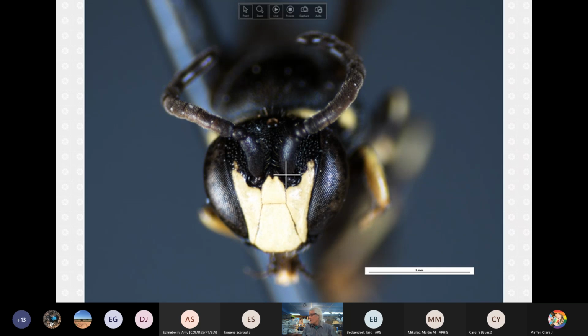I only have one specimen in my collection. We've given away far too many, I guess, to show, but it would also have a very much more concave aspect to the outer edge. And this varies depending on how you locate the scape when looking at it. So right now, the scapes are angled inward a little bit. So they're angled toward each other.